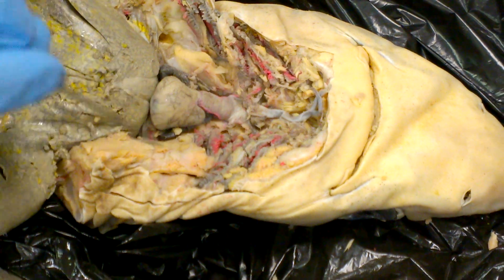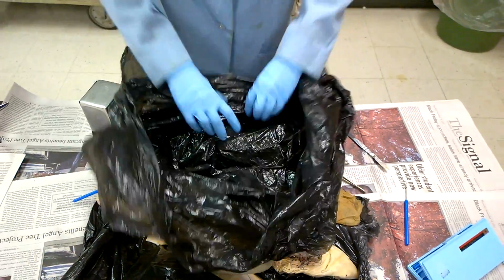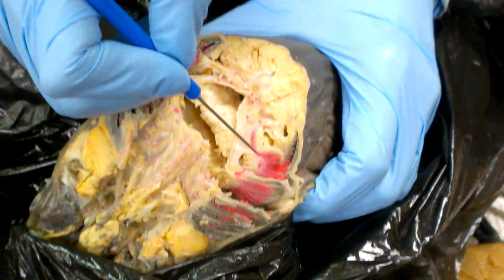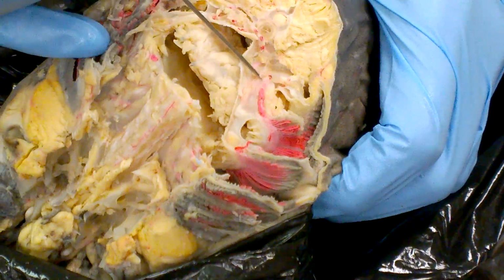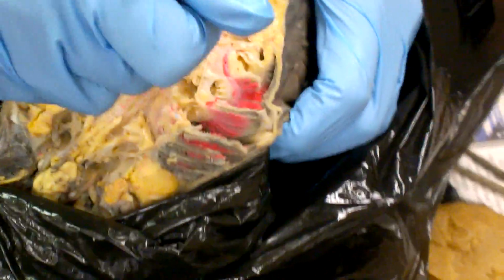And then the gills. And then, did you guys see yesterday on the test, the samples test? That's where I left it. And so then you can see here it's coming out of the gill and coming down to join the dorsal aorta. So what's this right here? That's the afferent. No, the efferent. Excellent. The efferent, E for exit, branchial artery. And then those come together from all the gills to form the dorsal aorta.